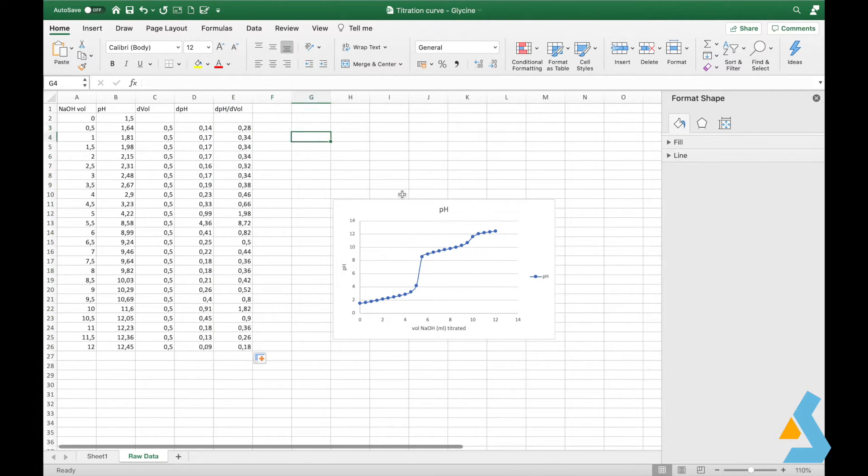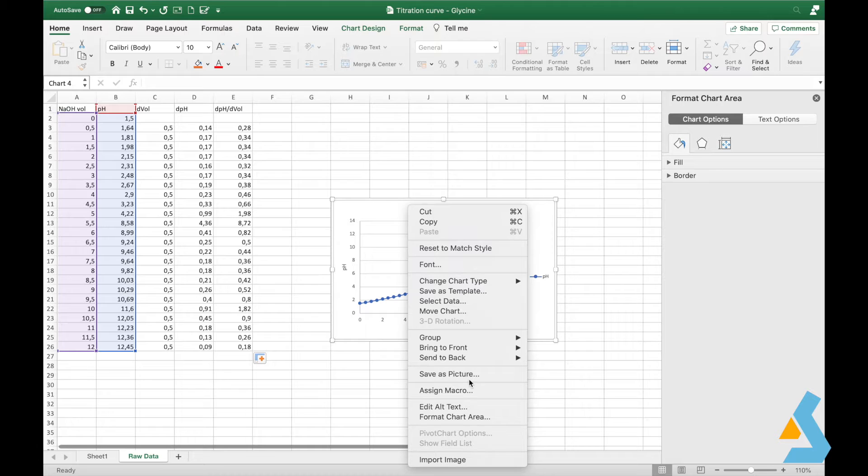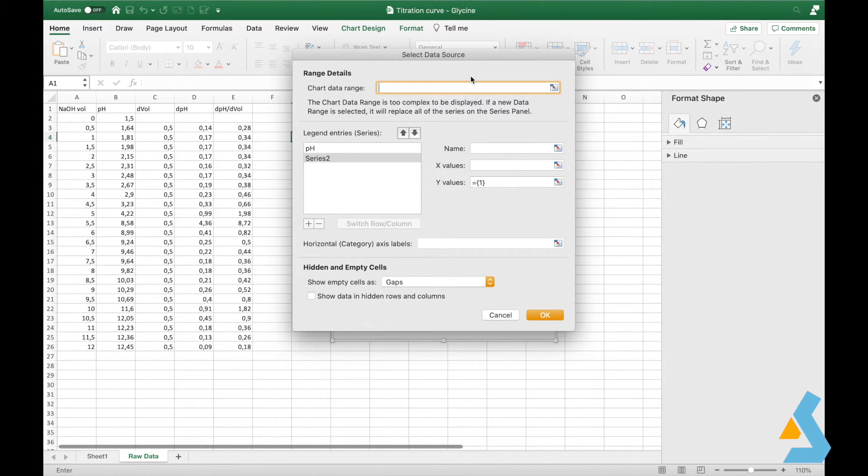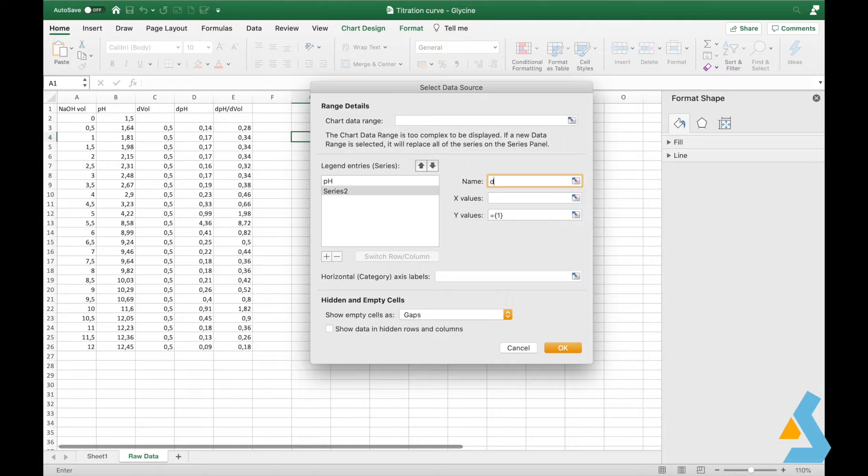Now, we can plot this new data. We go to our graph, then click select data and add new series, which we name delta pH per delta volume. For x values, we chose sodium hydroxide volume, and for y values, we chose the derivative values.